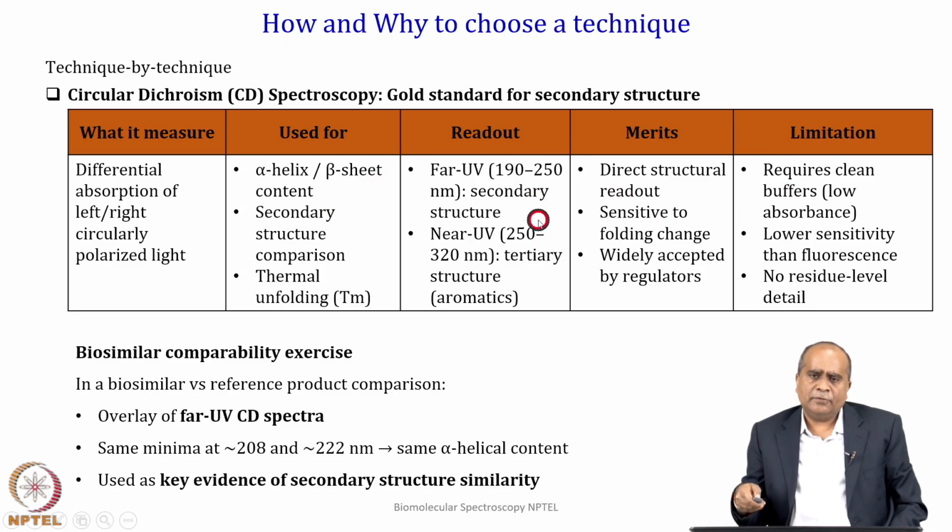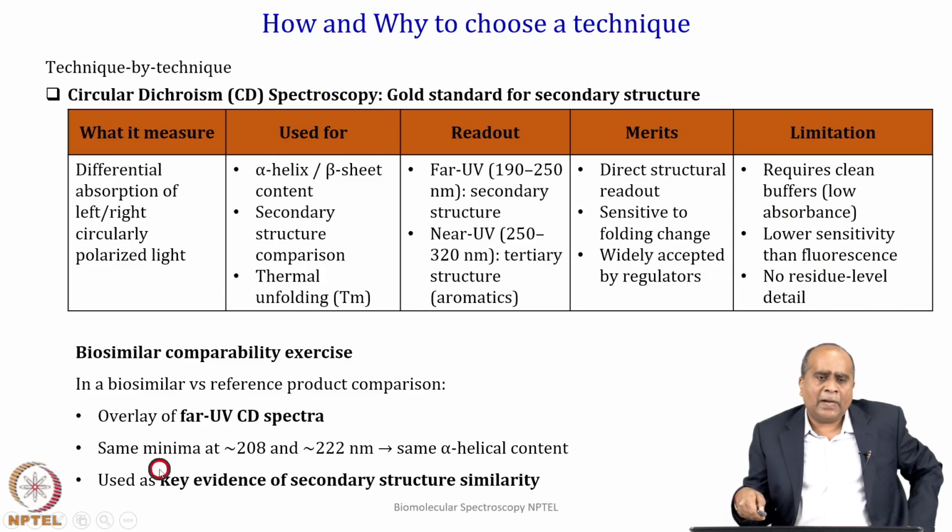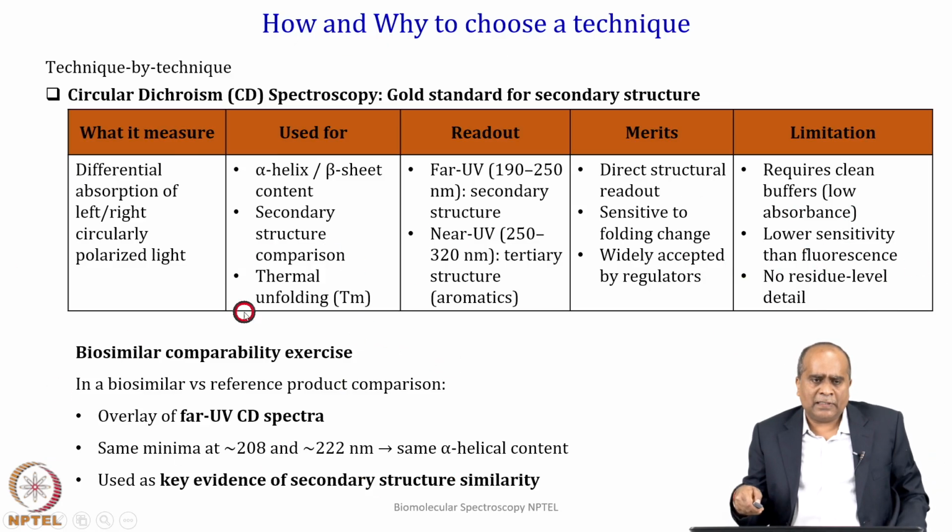It is sensitive to the folding change, and it is a widely accepted technique by regulatory agencies. The limitations are that it requires a clean buffer which does not absorb, so low absorbance, and it has lower sensitivity than fluorescence. Here we do not get residue-level details; you can get the overall fold, but not residue level.